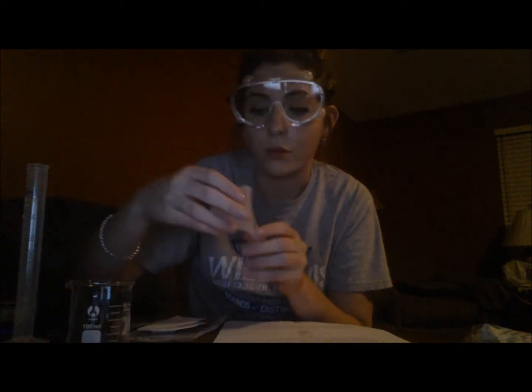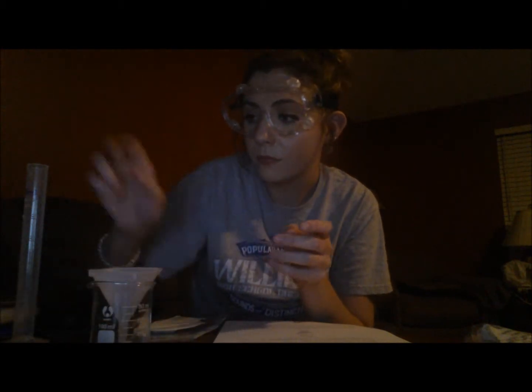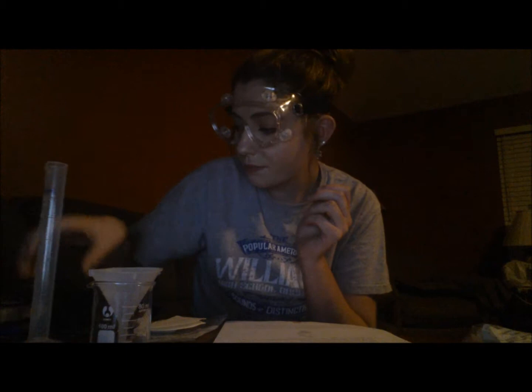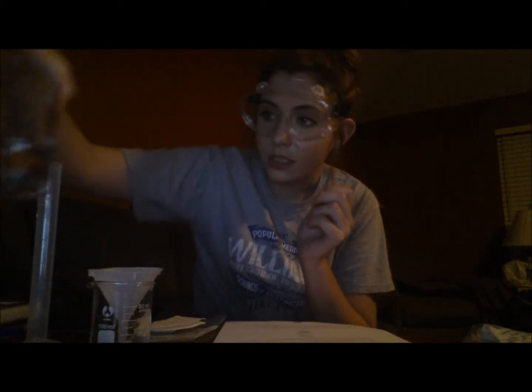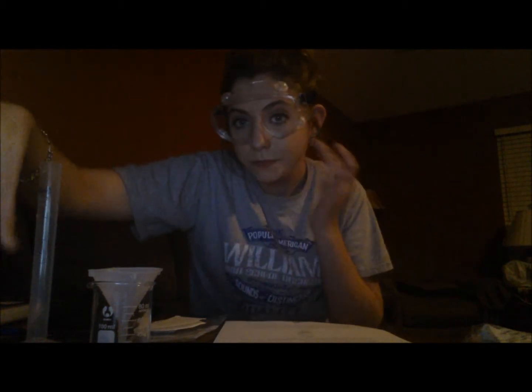In addition to that, we're going to be using a funnel, a 100 milliliter beaker, a graduated cylinder, our weigh station, and some distilled water.